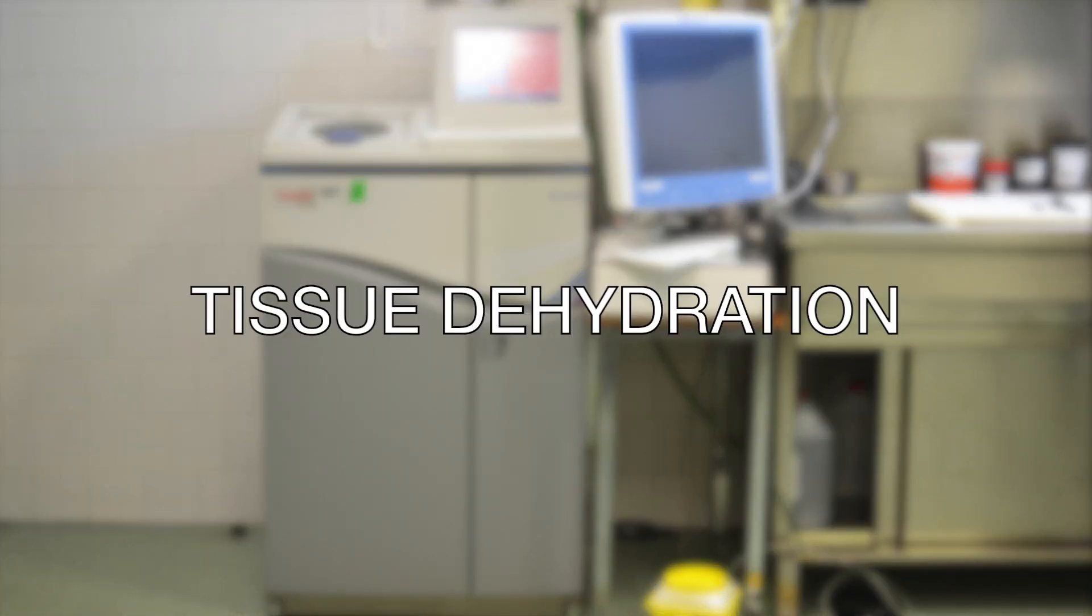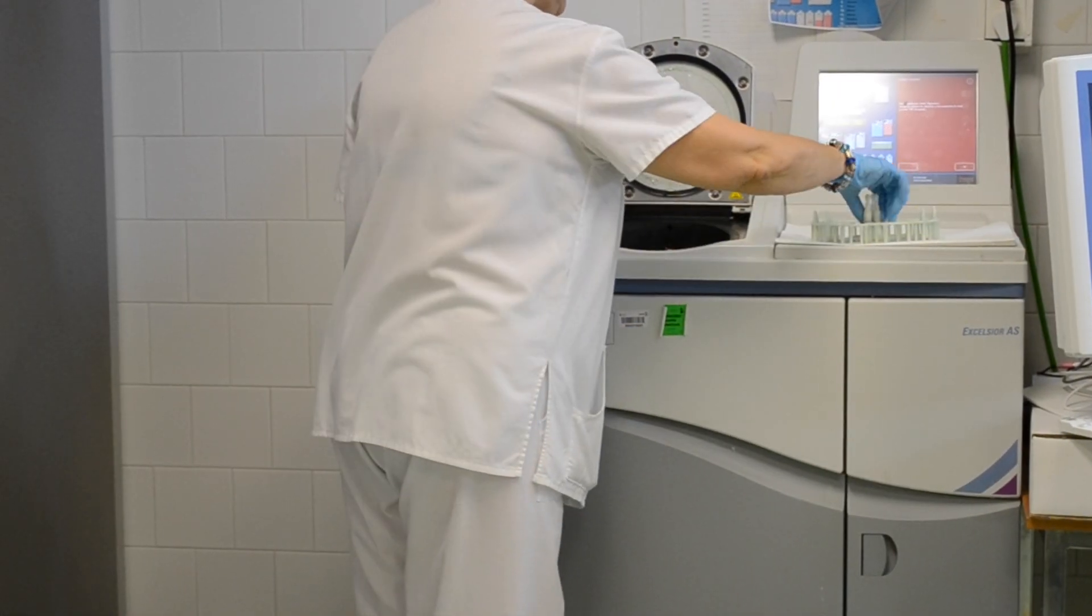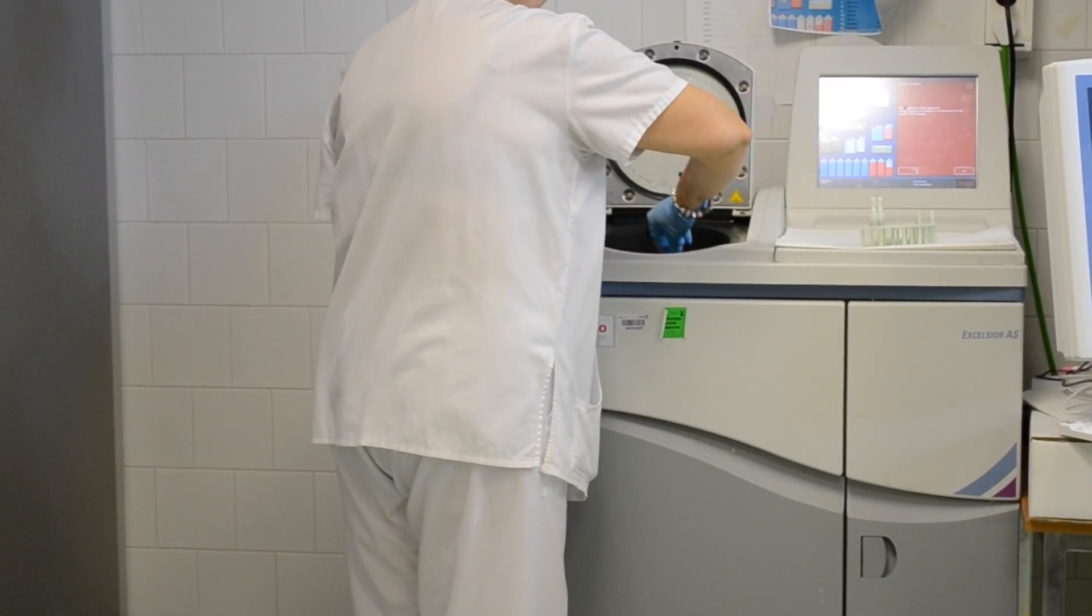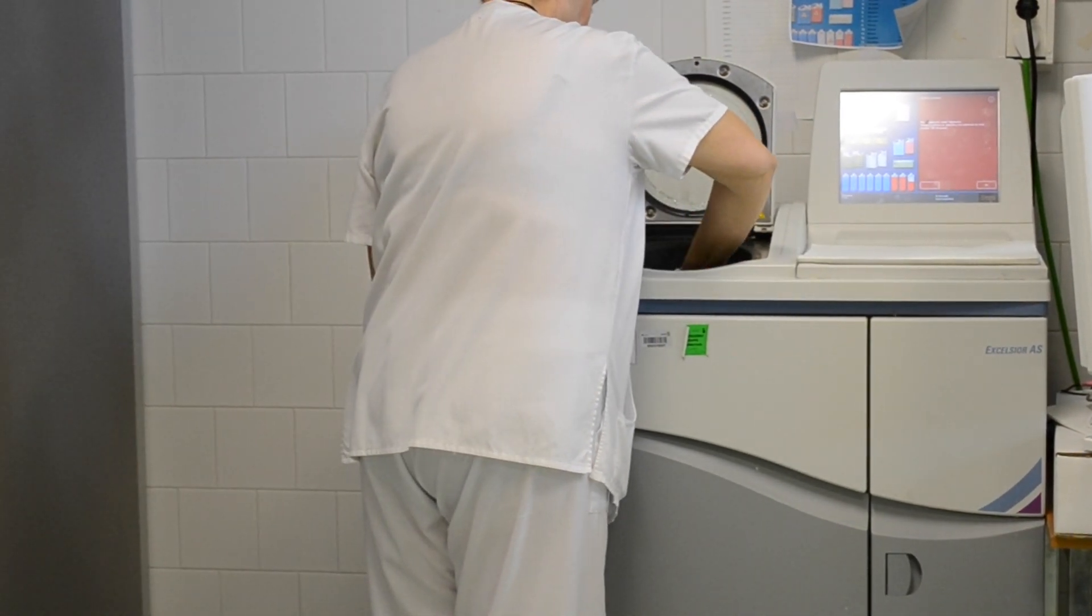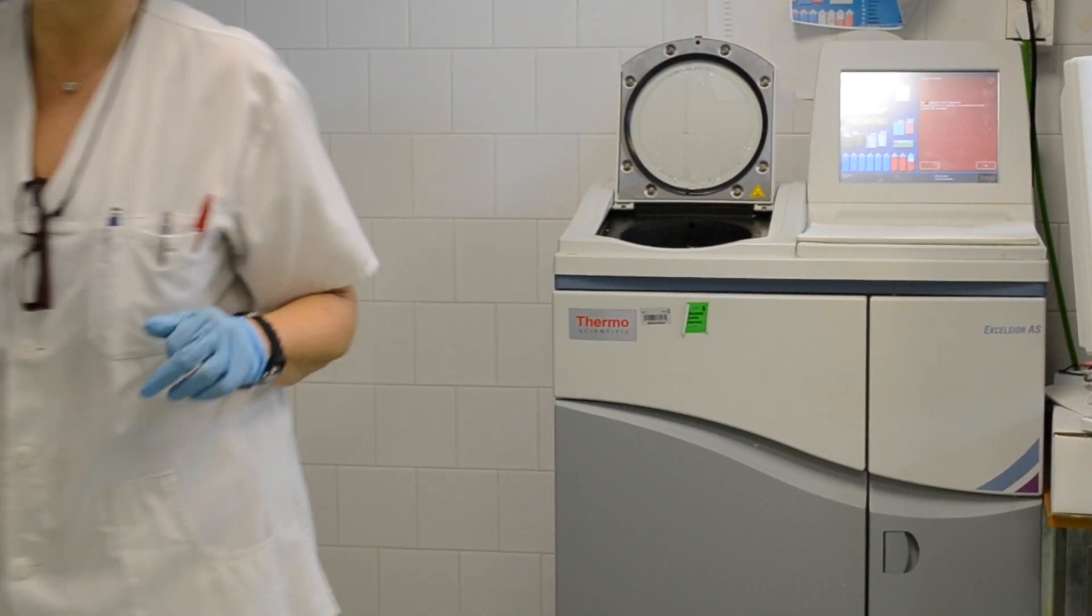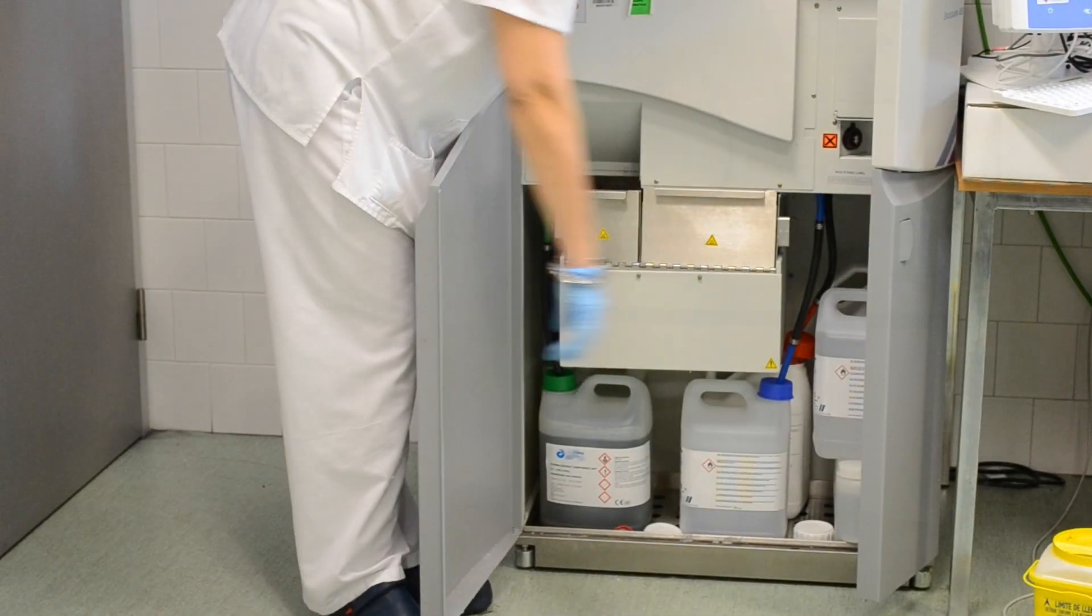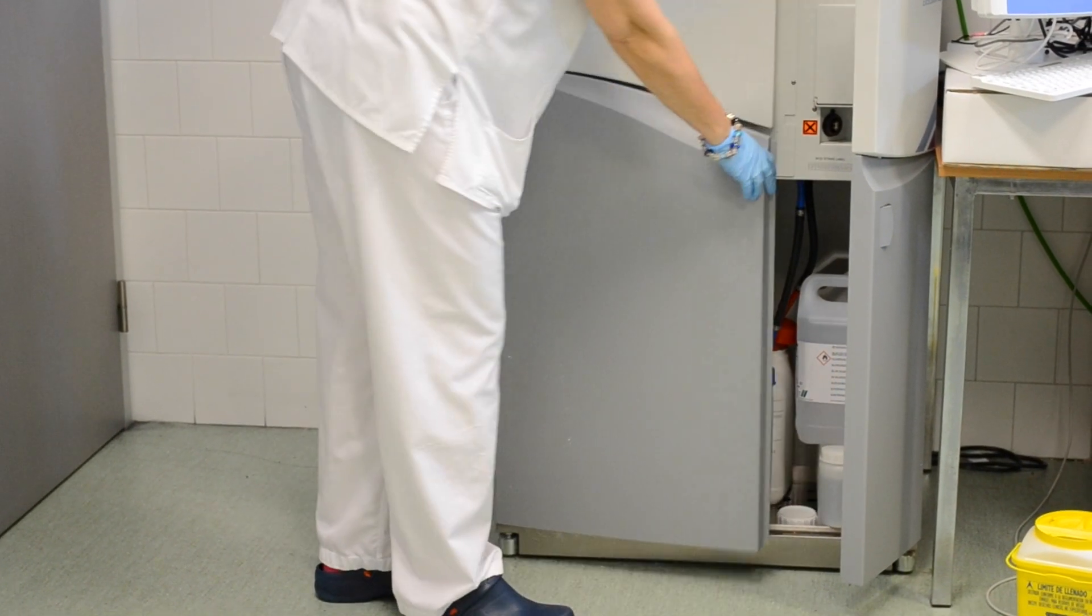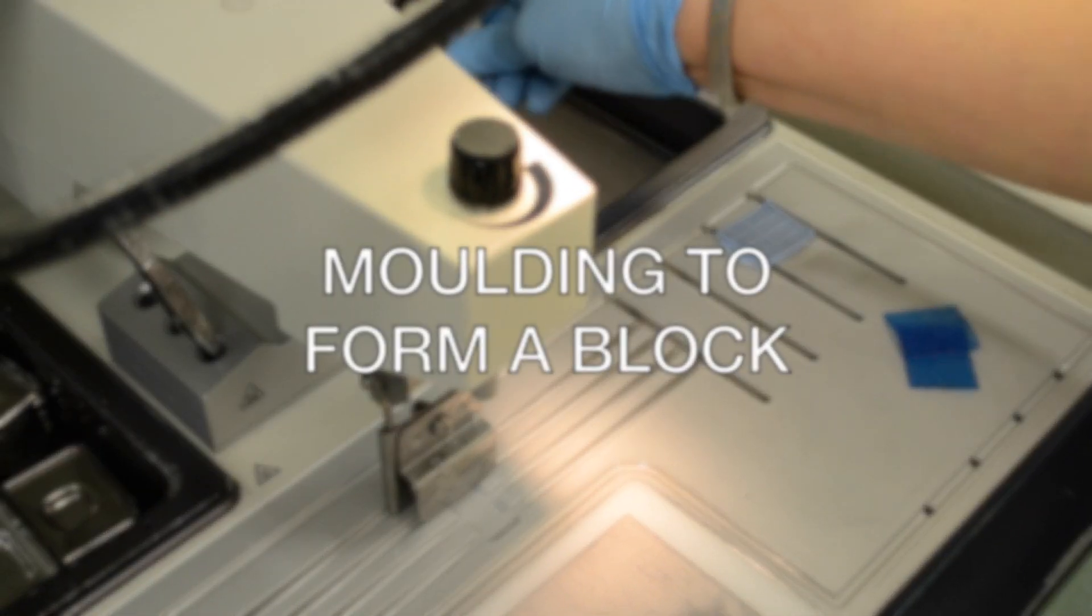To do this, we use a tissue processing machine. Once blocks have been prepared, they are included in this machine where the tissue is processed overnight through different alcohols of increasing gradation and xylene to dehydrate the tissue, that is, to remove the water and finally replace it with paraffin. All these components are located inside the machine and automatically the blocks pass through different phases. After 16 hours approximately, the tissue blocks are obtained.